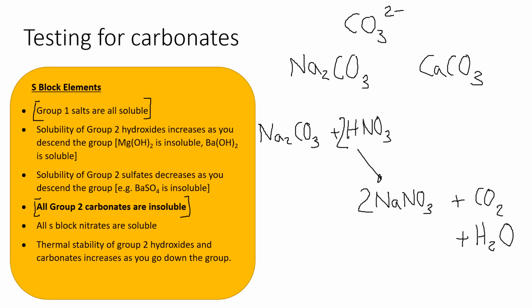Okay, and what you would see, very importantly, is a fizzing due to the presence of the carbon dioxide gas that's being produced. And to prove that it's carbon dioxide, you would bubble it through lime water, which would turn milky or cloudy.